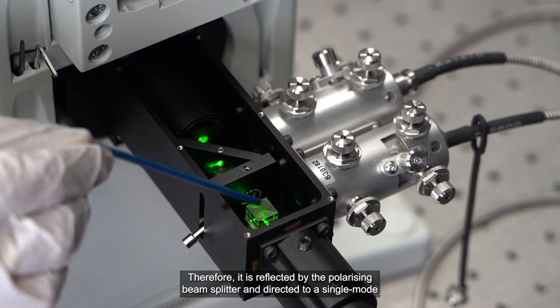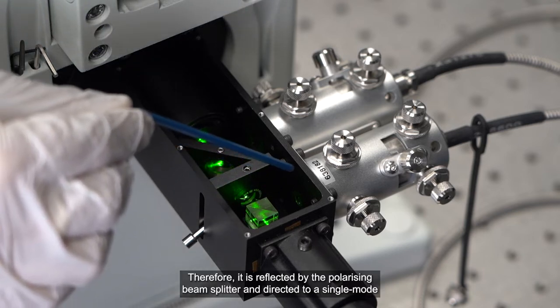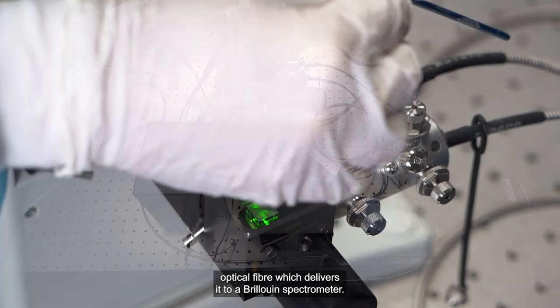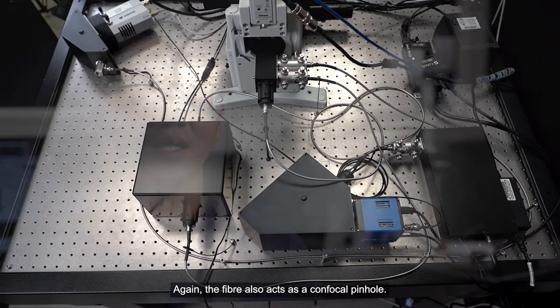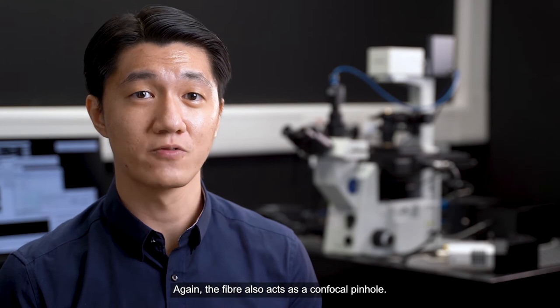Therefore, it is reflected by the polarizing beam splitter and directed to a single-mode optical fiber which delivers it to a Brillouin spectrometer. Again, the fiber also acts as a confocal pinhole.